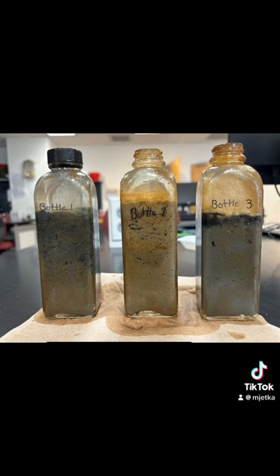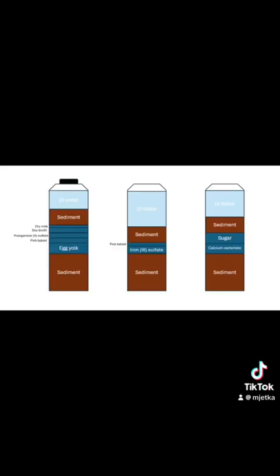MFCs are a way for the microbial communities to generate energy, and a way we can measure, in volts. In our experiment, we created 3 sediment columns to observe over the course of 6 weeks.